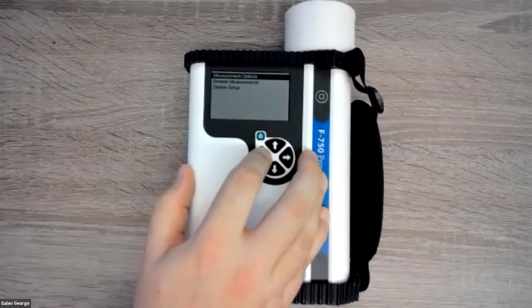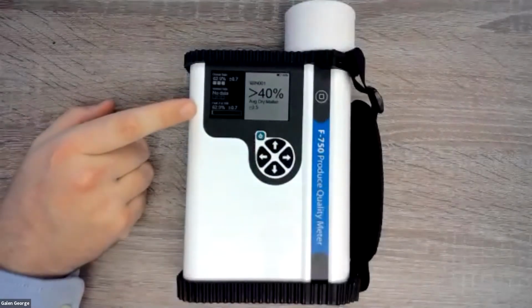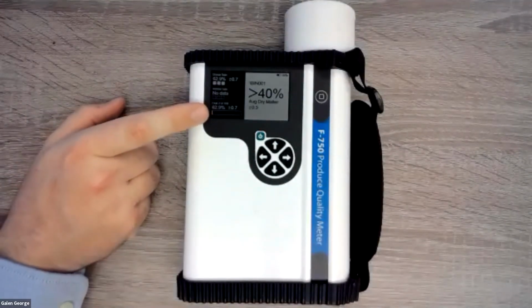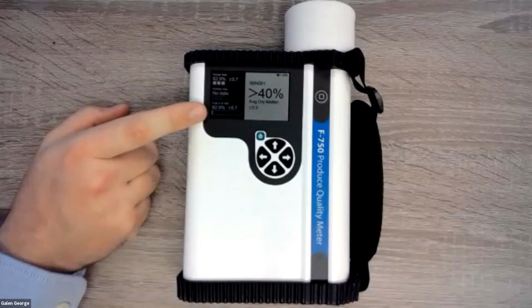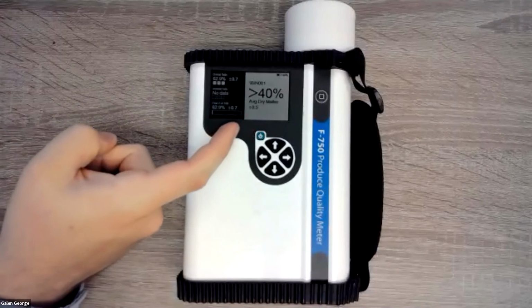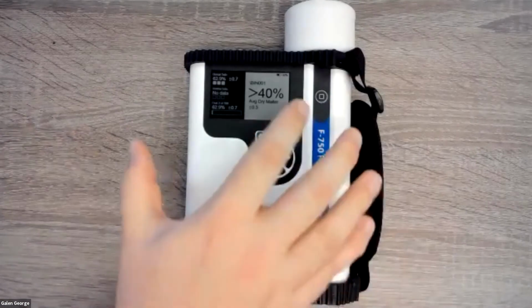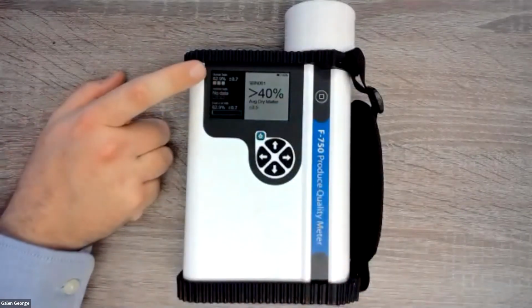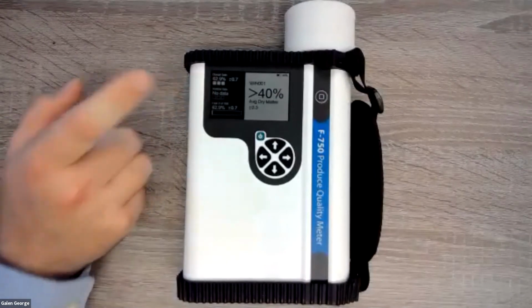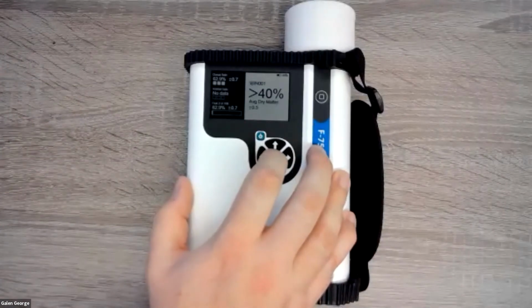So if I go back to our measurement screen here, now you can see that the boxes went away down here because I changed the number of fruit per bin to 100. Obviously there's not enough room on the screen for 100 boxes. Now there's a progress bar. So the bar will fill up as the number of avocados I scan increases. And if I wanted to change the number of sides that I scan, this would only have 1 instead of 2. So it's a lot of customizability built in just to the instrument itself, let alone all the customization you can do within AppBuilder.